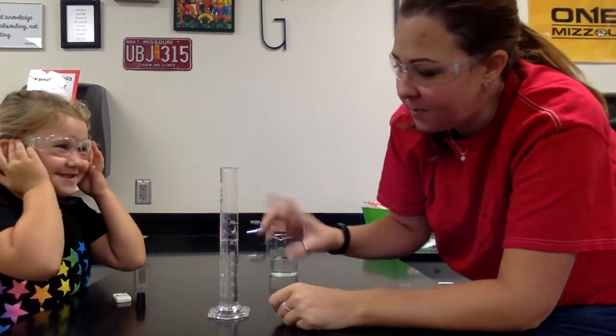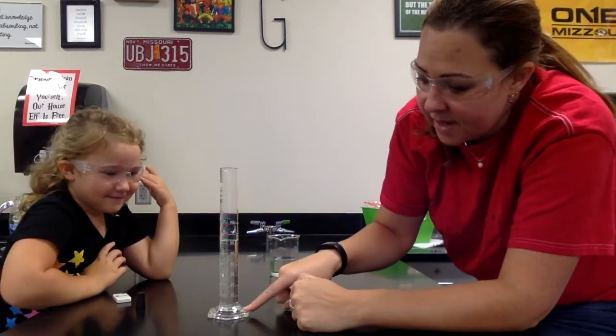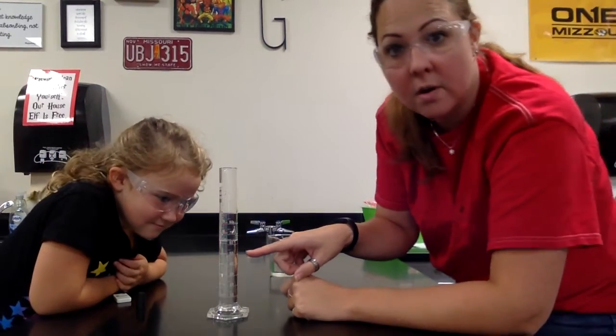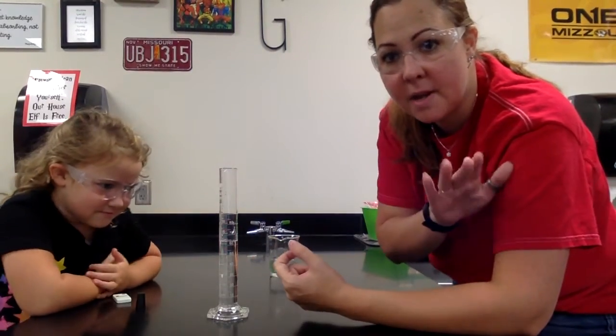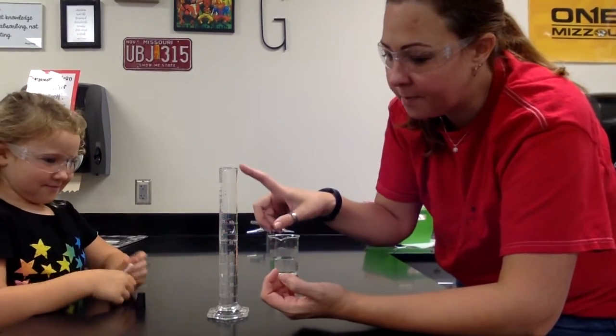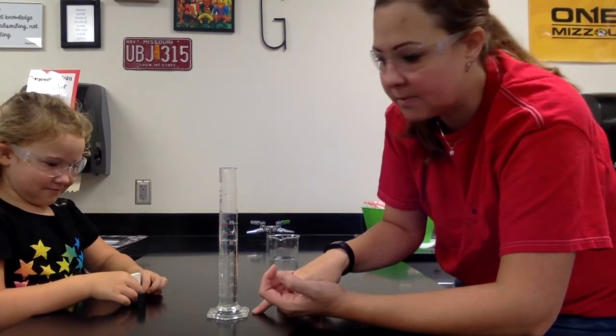Goggles on at the lab table. This measures out in milliliters. So right now I'm starting at 64 milliliters. Again, the data in your lab might be a little bit different than what I just poured because I just kind of randomly poured water in here. So I have 64 milliliters that I'm starting with.